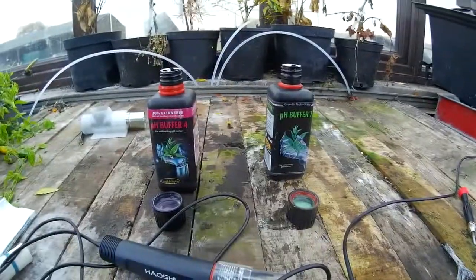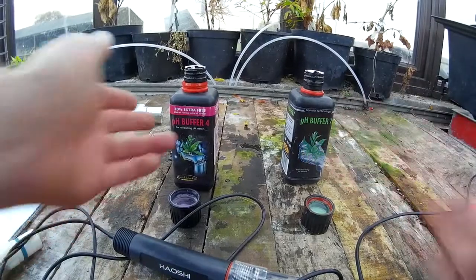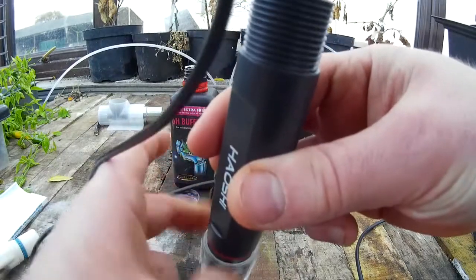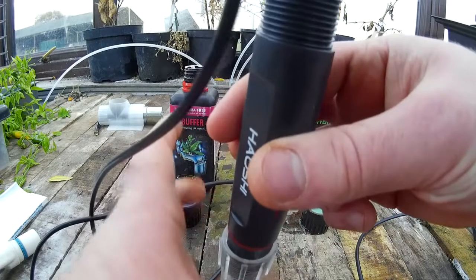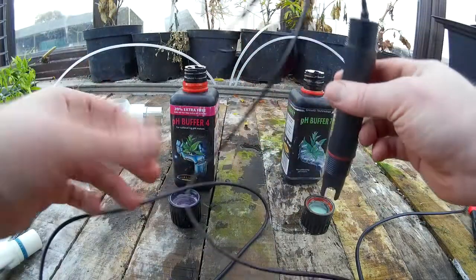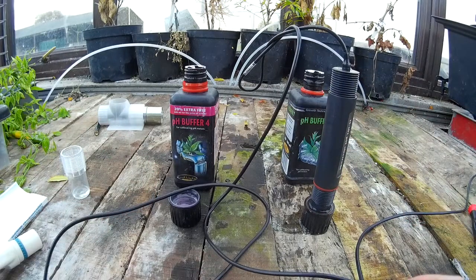You'll also need some pH buffer for calibration — you need your 7 and your 4. Pour them into the lids like you can see just there. Take your pH probe and place it in the pH 7 buffer like so, and reset your screen.